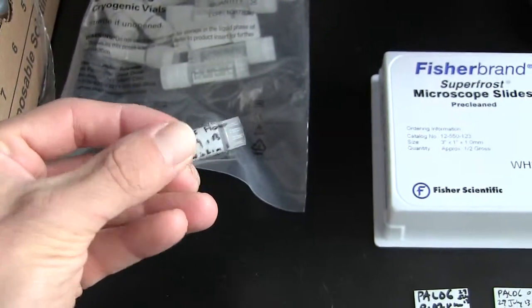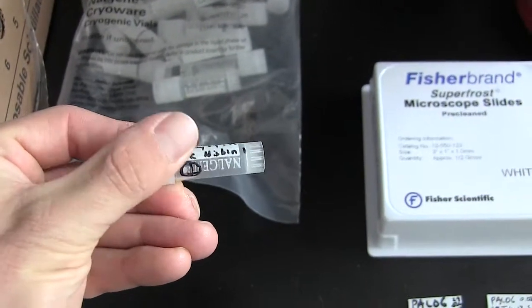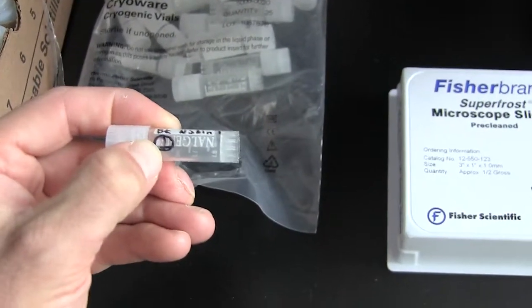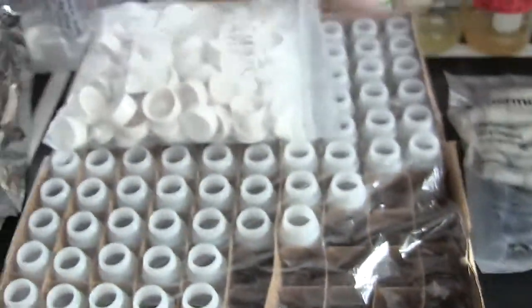I've written flow for flow cytometry samples, then we have a date, my initials, and then the Niskin it came from. Because we do 3 replicates per Niskin for flow cytometry, I've written a 1 here, so it'll be 1, 2, 3. Okay. Next, the nutrient samples.